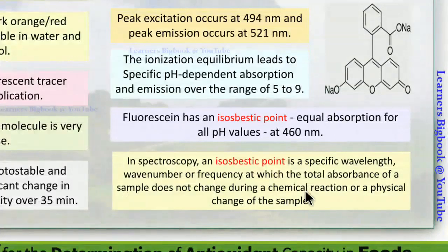So here, when you are going to consider any pH, it is not between only 5 and 9. Majorly, if you consider between 5 and 9, it will be good. More acidic or more basic pH doesn't give good values.